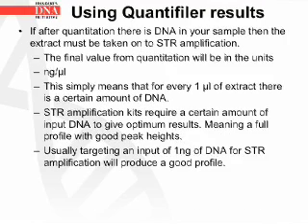If after quantitation there is DNA in your sample, then the extract must be taken on to STR amplification. The final value from the quantitation will be in the units nanograms per microliter. This simply means that for every 1 microliter of extract there is a certain amount of DNA. STR amplification kits require a certain amount of input DNA to give optimum results, meaning a full profile with good peak heights. Usually targeting an input of 1 nanogram of DNA for STR amplification will produce a good profile.